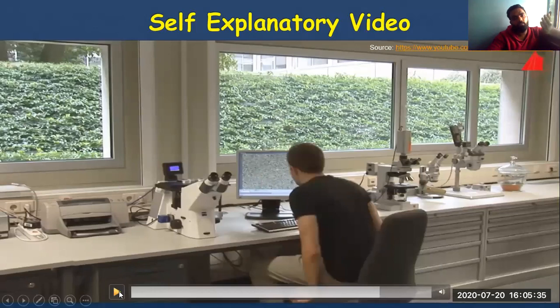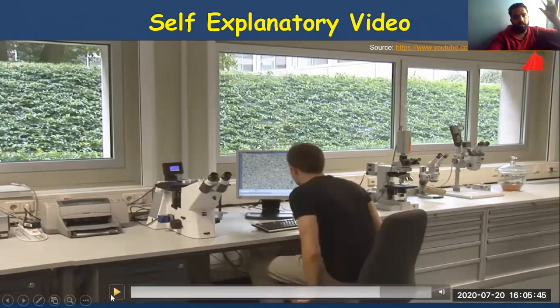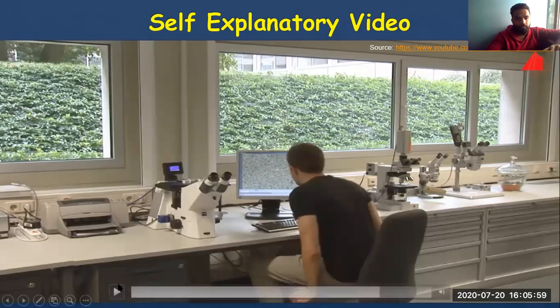Initially, they just saw the inclusions and the foreign particles. Now he wants to see the grain boundaries and grain particles. Just as I explained to you in the morning. It is one of the parts of metal. It might be anything, but it is carbon steel, plain carbon steel, medium carbon steel you can say, of 0.45 weight percent carbon.